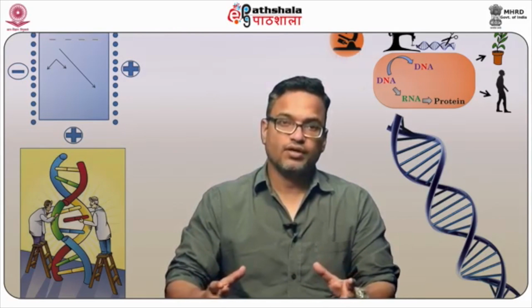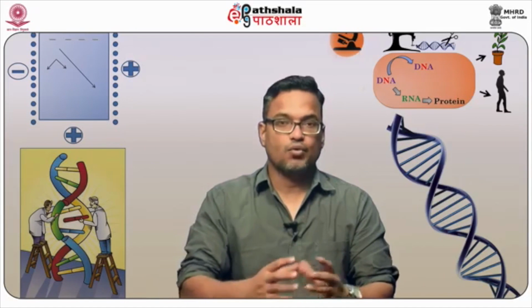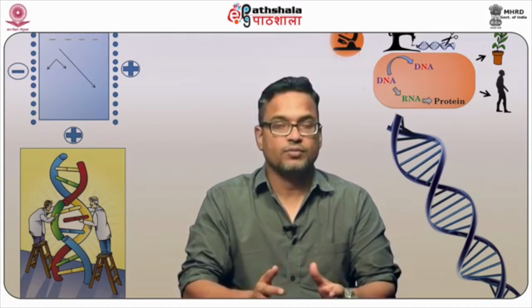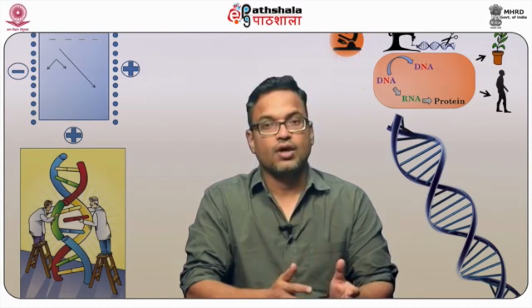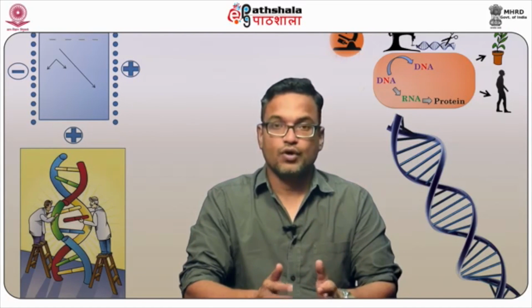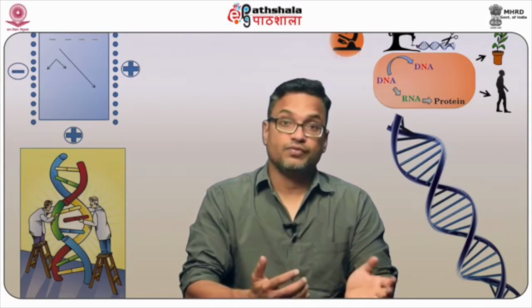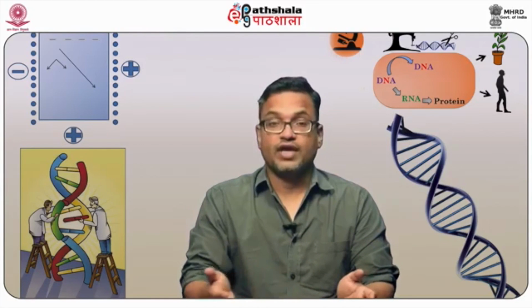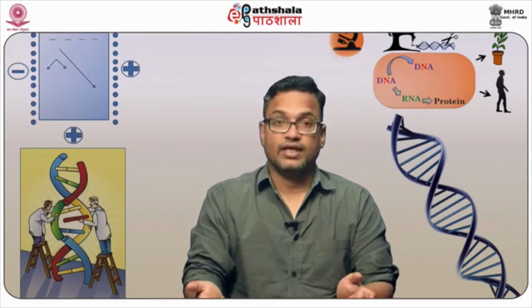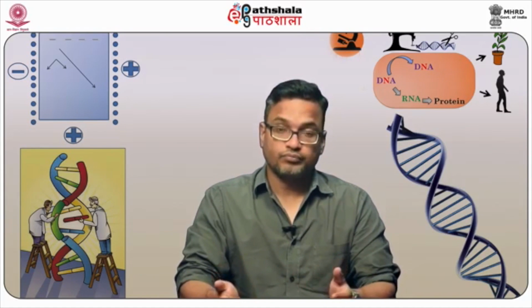The basic components of a microscope, however, remain the same. It requires a very high quality objective lens, so that we have minimal aberration, whether chromatic or spherical aberration. Also, the source of illumination has changed, from natural light to the arc lamp, and now we have high quality LED light sources that are used to illuminate our fluorescent tag.